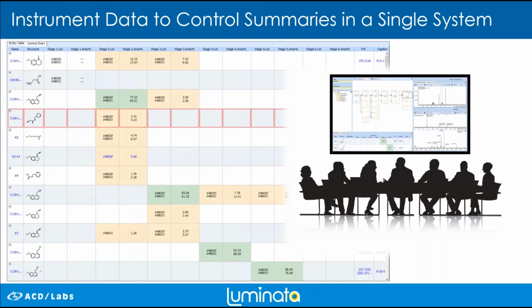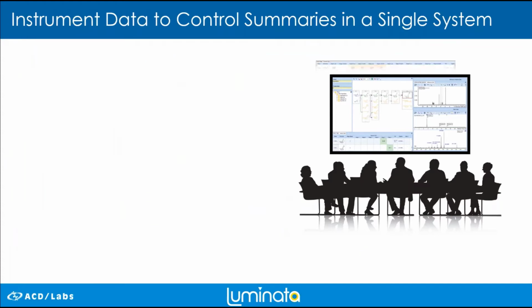Now, finally, a hidden thing that we never realized within the software is that once people that have adopted the software started using it, they really reduced the amount of paper that they had to deal with in Excel. And what that meant was that if they were going in a project team meeting, let's say every 2 weeks, and having that discussion, instead of talking to the process chemist and asking what's the optimized step, or asking the analytical team, did we remove the one impurity through that one method, they started bringing the software. So having that software within the meeting really helped a lot.